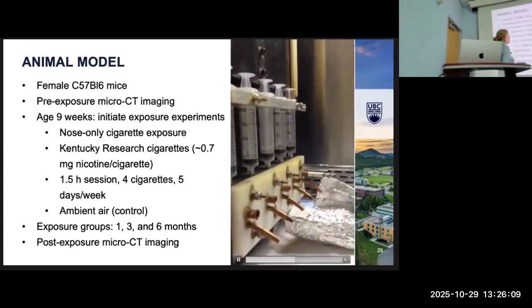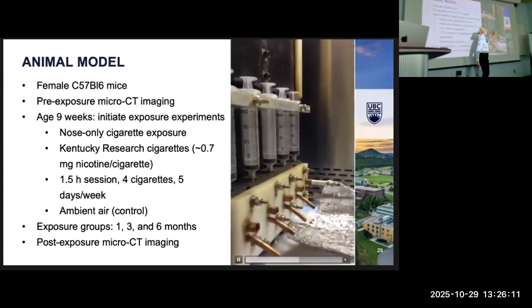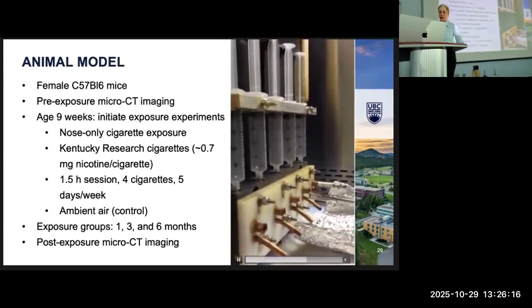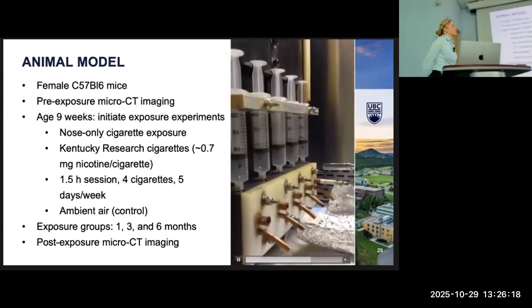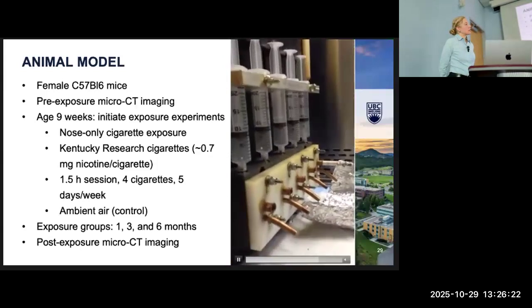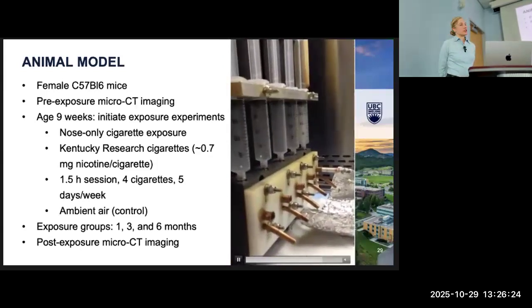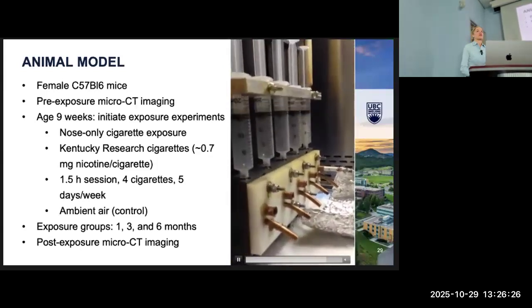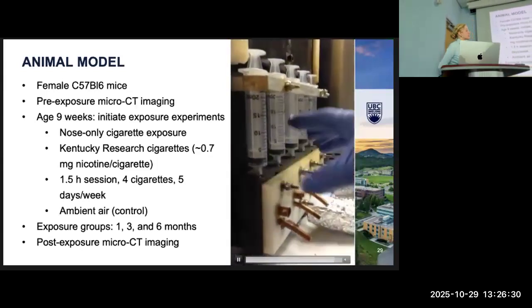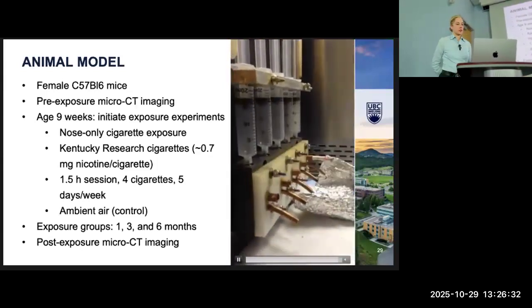And then if you watch carefully, this one will draw up. When they turn it on, it will draw up smoke. And so it will look very cloudy. I think it's the next draw. So that last syringe is now very cloudy because it's pulled up all that smoke. So all that smoke is now going to be pushed out the exit port to where the mouse would be.